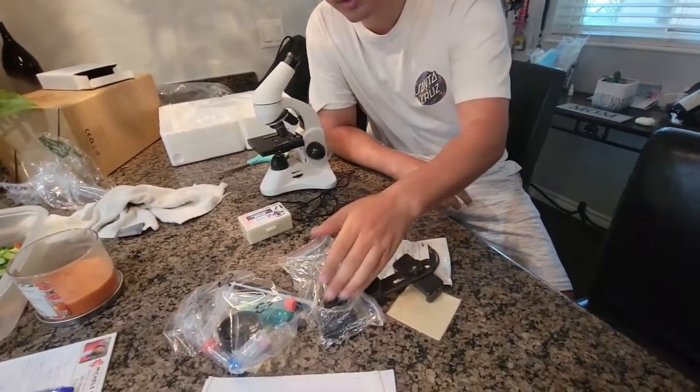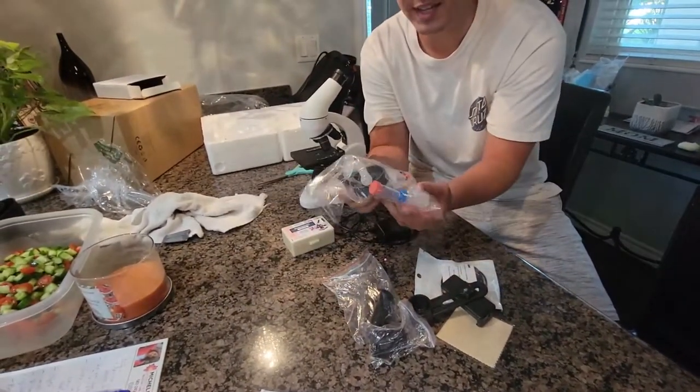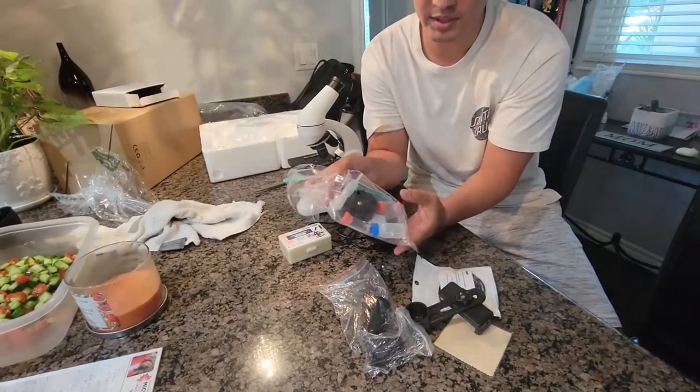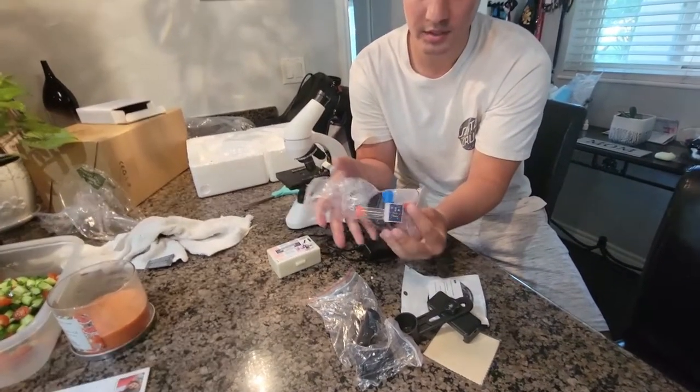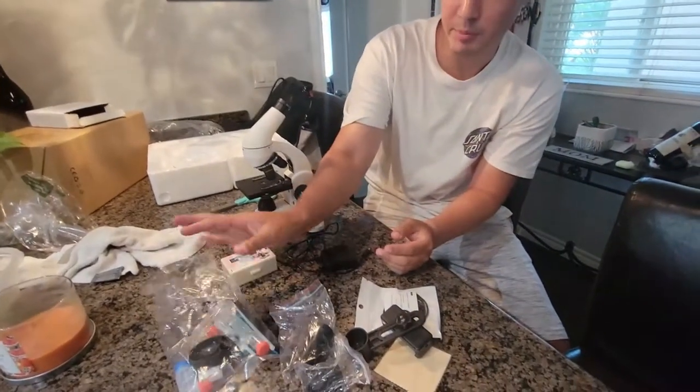It also comes with a few other things. It comes with a little set — if you were trying to do an experiment, it comes with different tools in here that you could use to do your experiment and prepare slides as well.